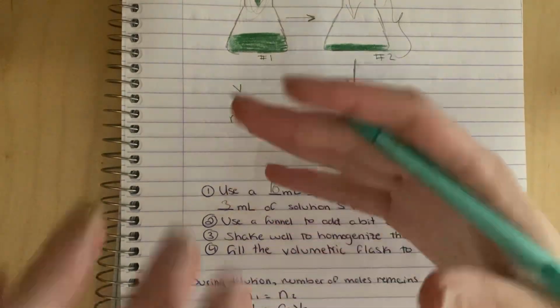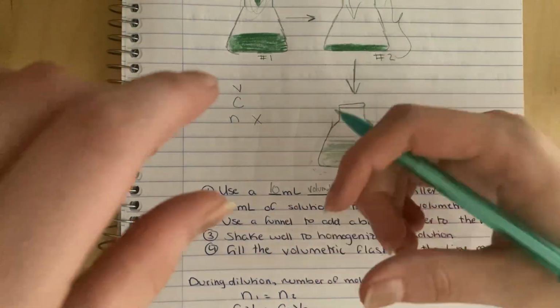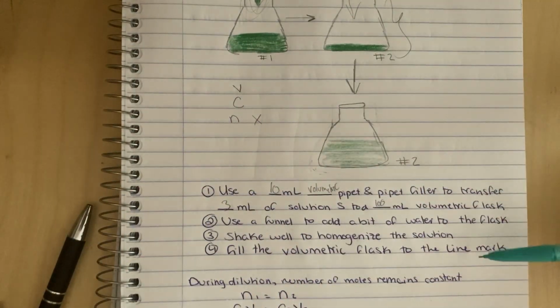We can't shake something when it's full all the way up to the top. So we add a bit of water, we shake it to make sure it's mixed, and then we fill the volumetric flask to the line mark.